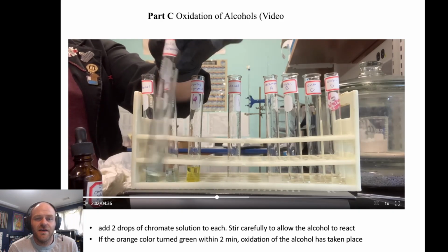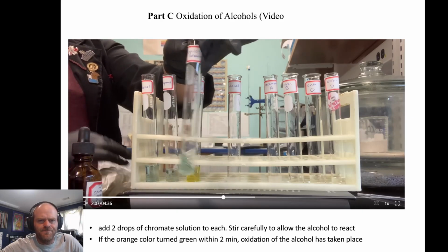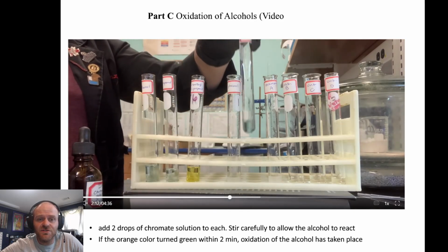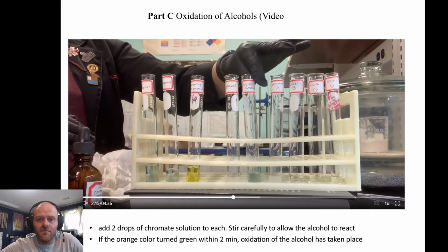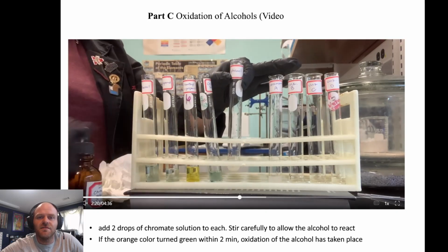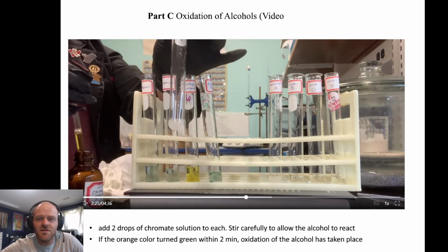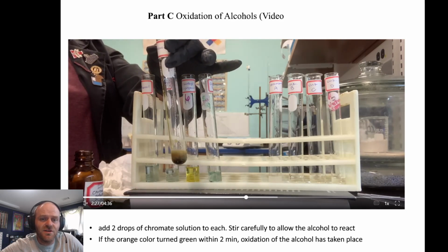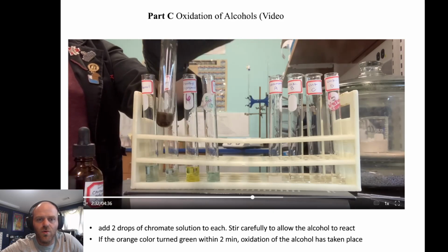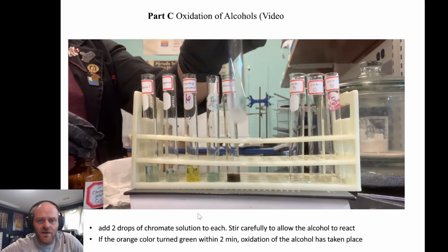So this is cyclohexanol. Notice that it's green. The chromate solution is kind of a yellowish orange. Oops, she messed up. Don't do that. Okay. Now on the phenol, the chromate solution is kind of a yellowish orange. So if a reaction occurs, it'll turn a different color, either green or brown. If it stays yellowish orange, then there was no reaction.